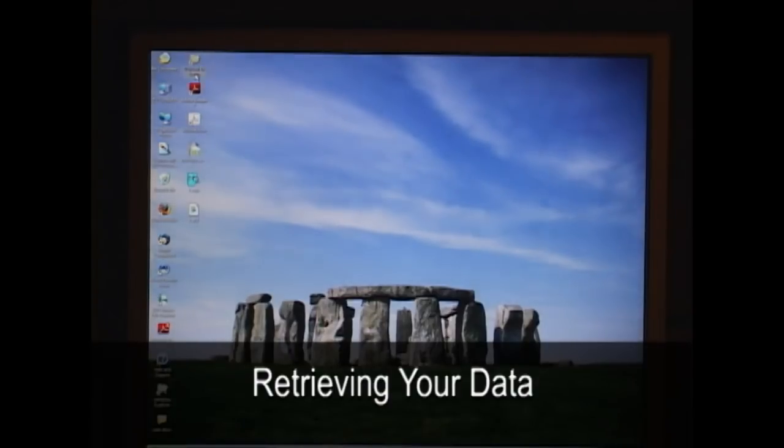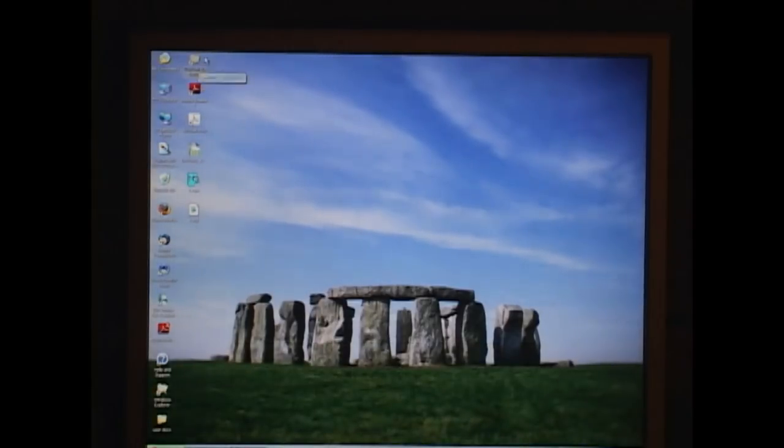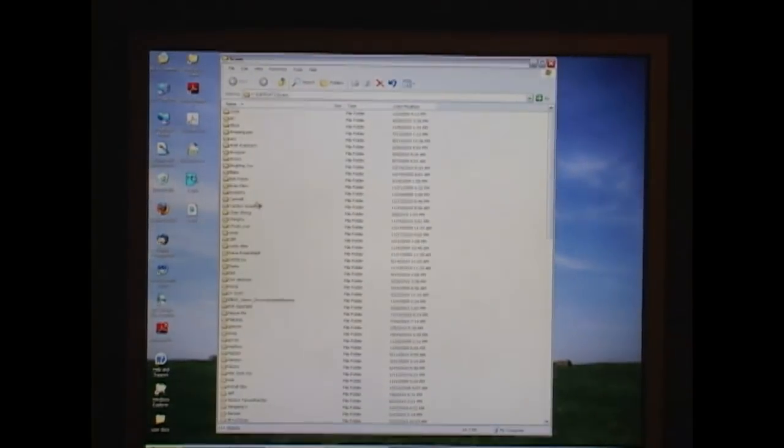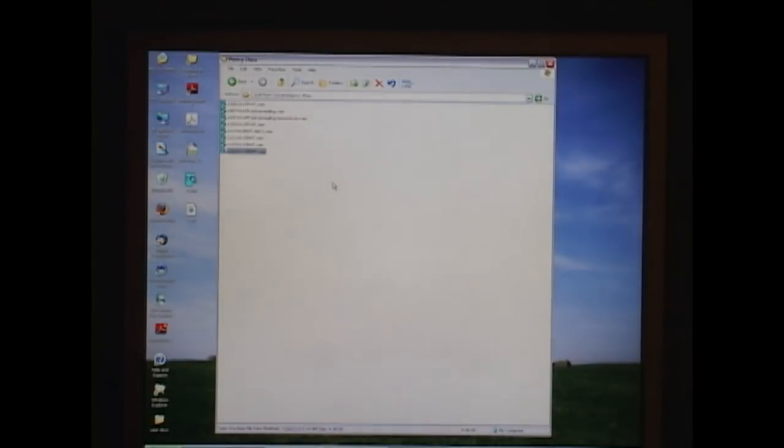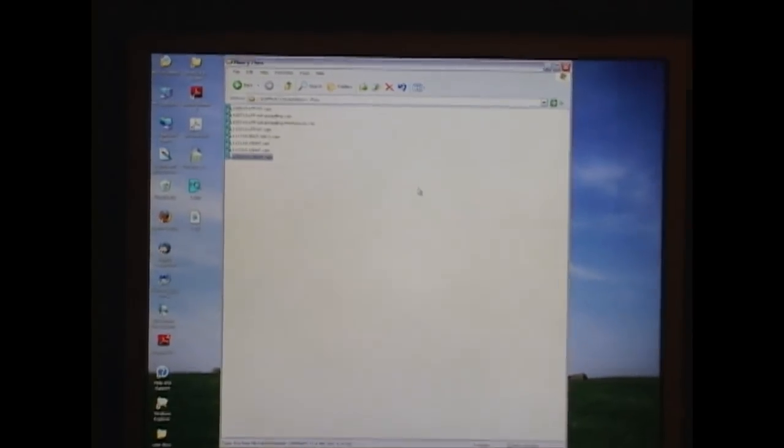Your scan file is automatically saved to a scan folder and we have a shortcut to it on the desktop. What people do is they find their data when it's finished. And with a USB drive, we also have a three and a half inch floppy and CD, whatever you have. Just find your sample and save it to whatever drive you have. And this sample can be opened in X-ray diffraction software designed for that.